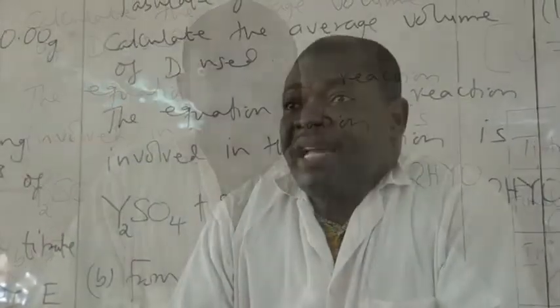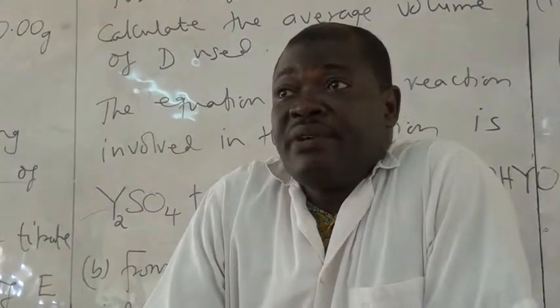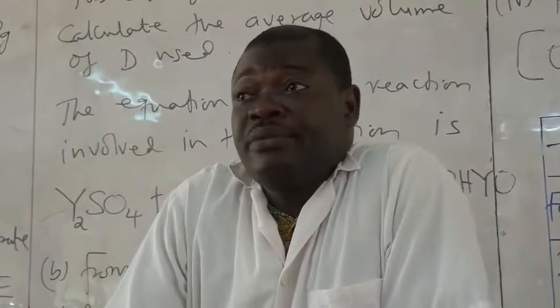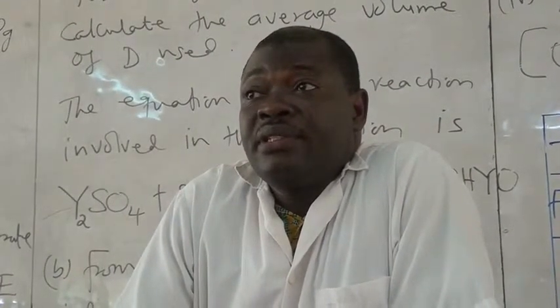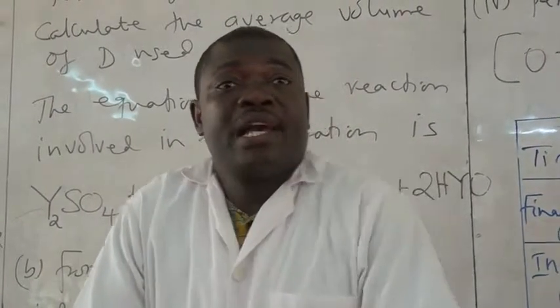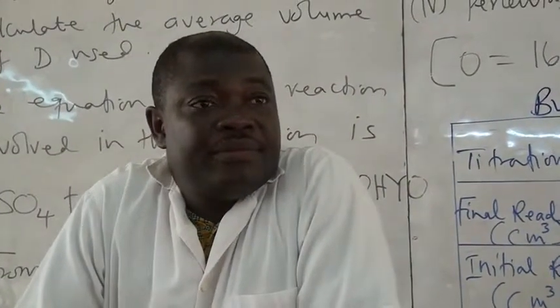Your first value. 30.10. That's a bit too much. Your solution was too deep. Second value. Yeah, it's somewhere around 12. How about you? First value. Okay.